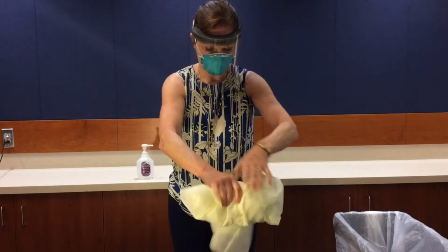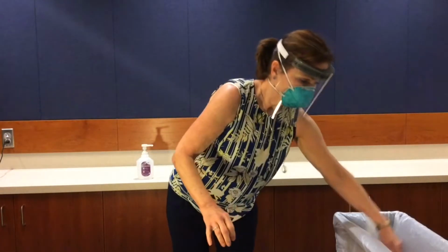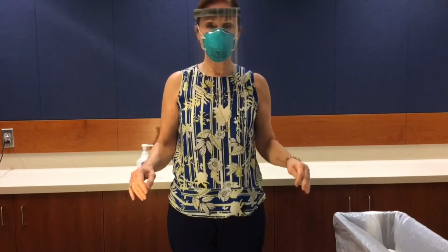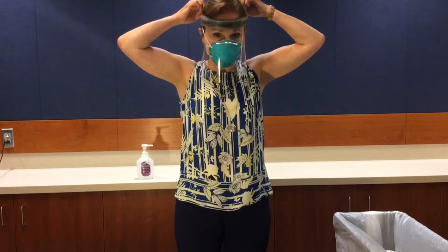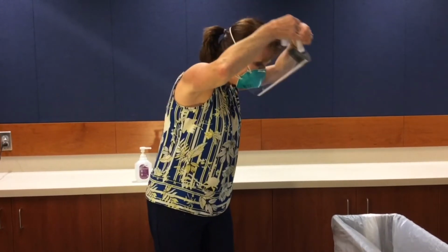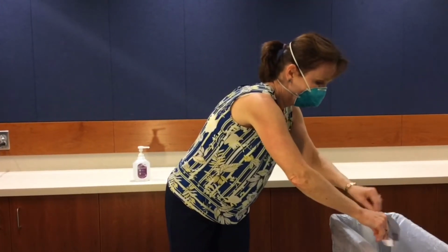Next, carefully remove the face shield or goggles, being careful not to touch your face. For the face shield, grasp the strap at the back of your head, pull the strap over your head in a forward motion, and move the shield away from your face. Do not touch the front of the face shield or goggles, and dispose into a waste receptacle.